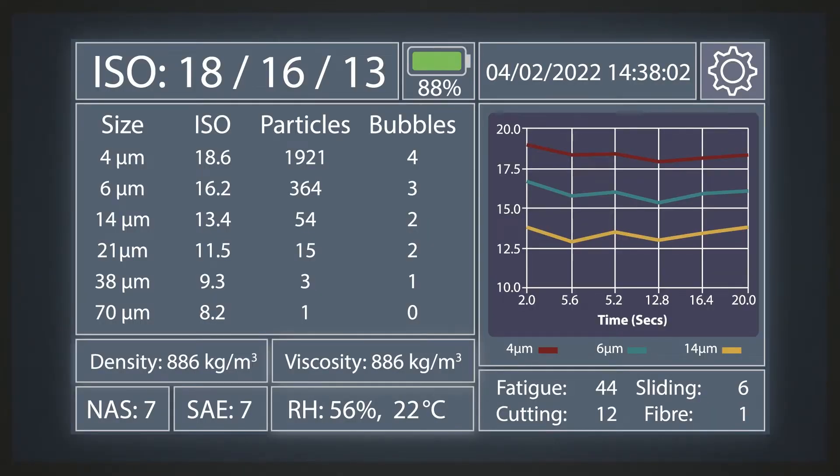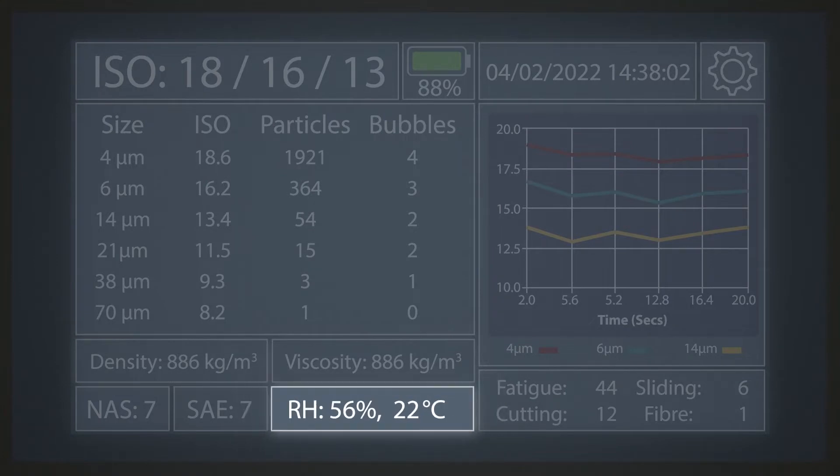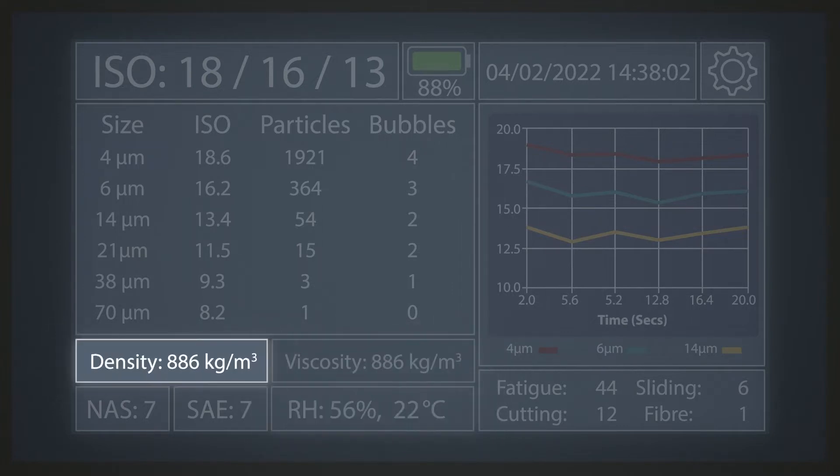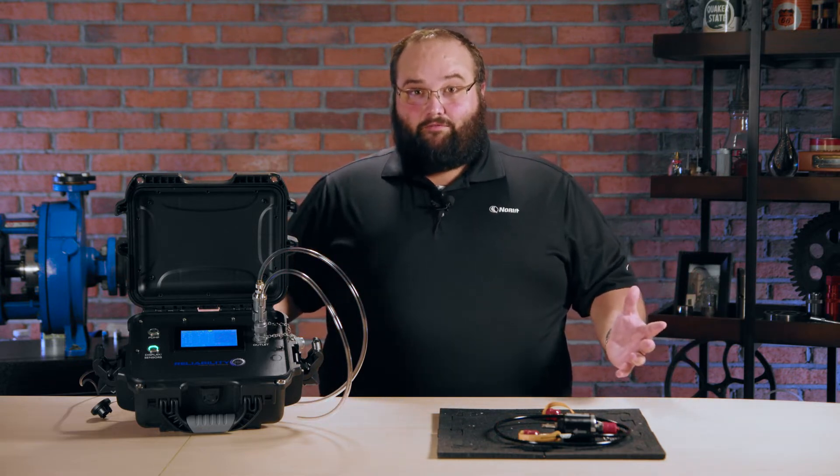This comes in 16 different configurations and you can put in different sensors to give you relative humidity, water in parts per million. You could use it to give you viscosity readings. It also tells you temperature and density. It comes with different pump options and works with a variety of different fluids.